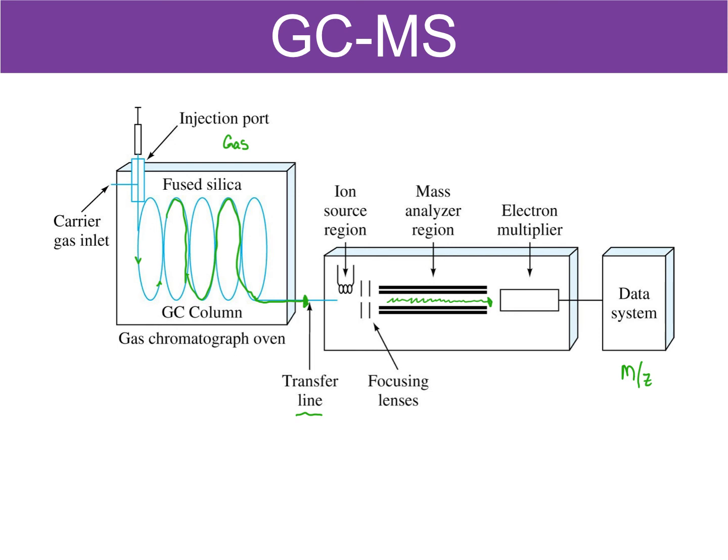So we're going to talk more about chromatography in the next unit and really go into how these chromatographies are working. But this should give you some idea on how mass spec is working.